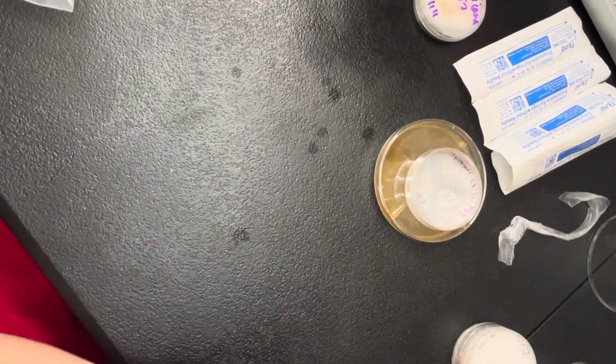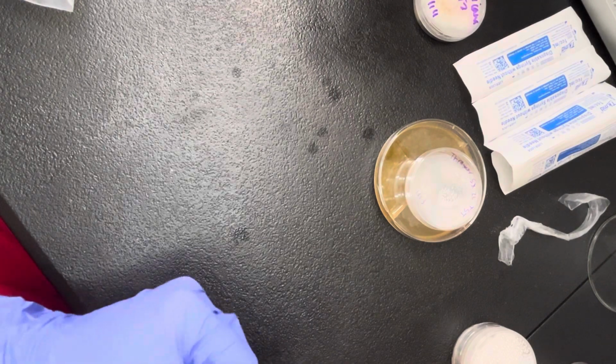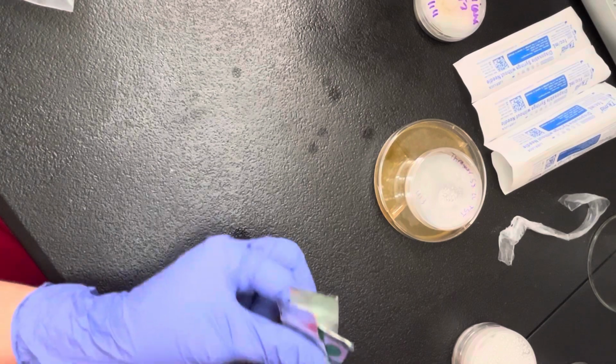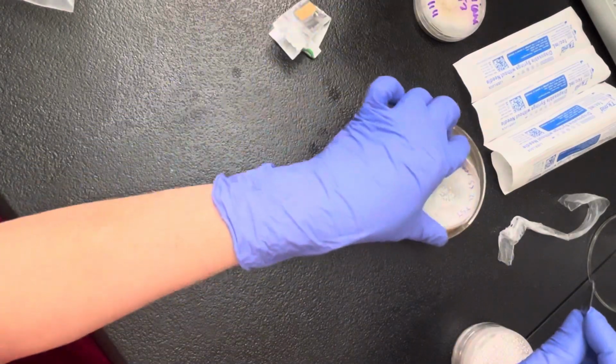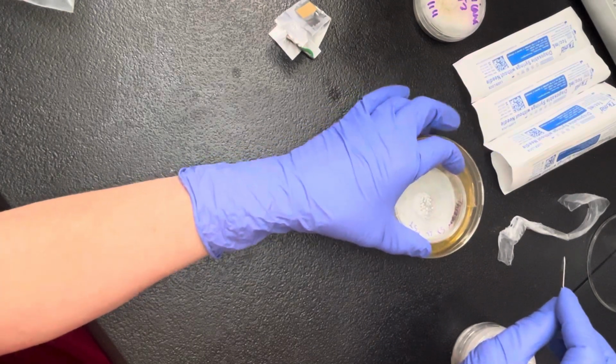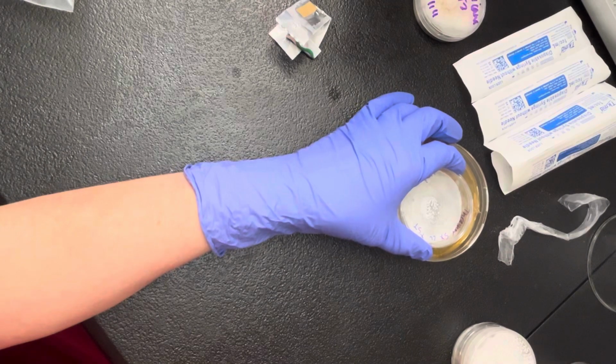I offered this strain a while back, and I tested that LC. I saved a master for myself. I tested it recently to see if I could grow them again, if the LC was good, and it looked good. So the key when you're doing open air transfers is that you want to be very quick. It is your job to be speedy. So let's go quickly with this.